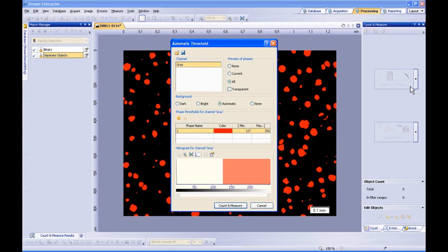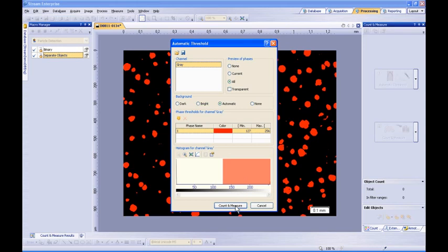Setting thresholds is a process in which we segment the image into two distinct components. One of which are the particles to be detected, and the other is simply the background not to be detected. We can automatically segment our image by selecting our background, whether it's dark, bright, or automatic.